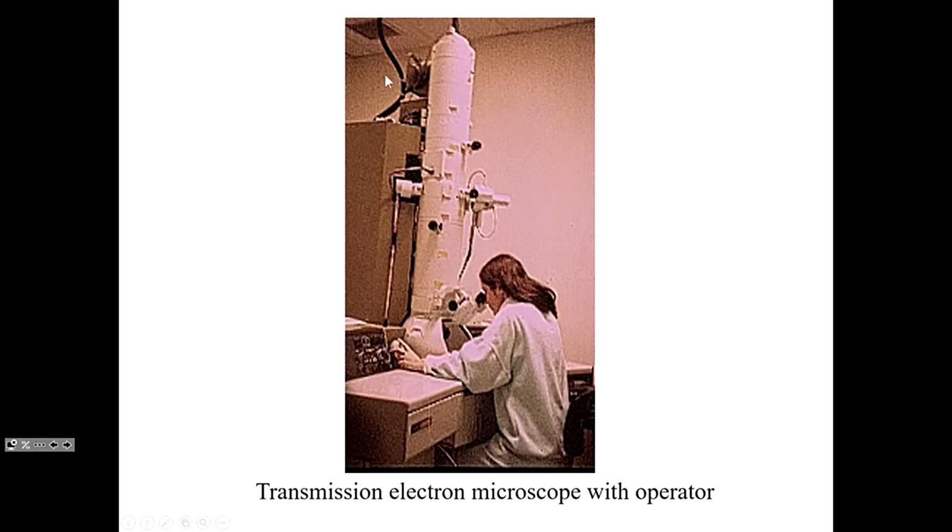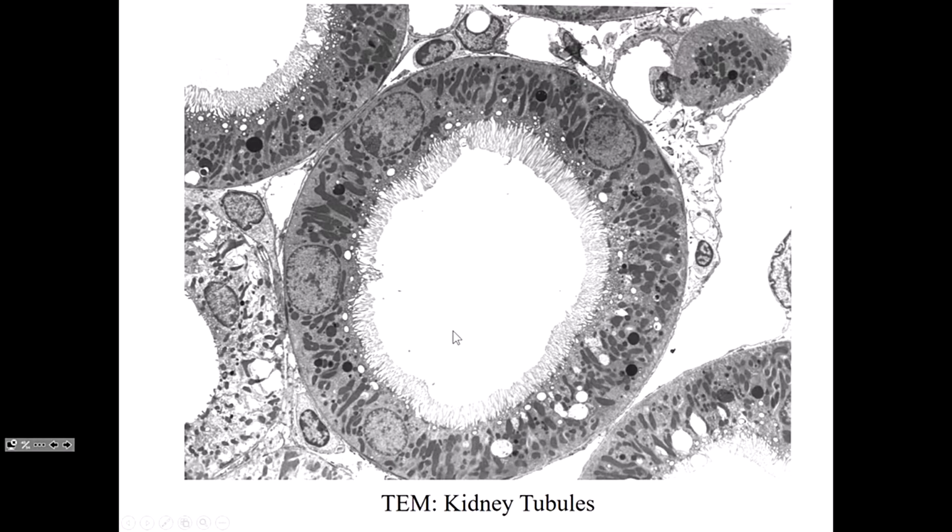We're shooting a bunch of electrons down through this structure, which has electromagnets which are focusing the beam of electrons, and is projected onto a fluorescent screen down here, where we can see the magnified image, and then we can take a picture of it. And we'll see something like this. Again, this proximal convoluted tubule of the kidney. We can see now structure within the nucleus. We can see mitochondria and more detail of the microvilli.